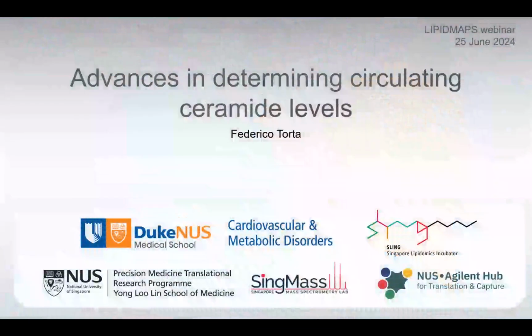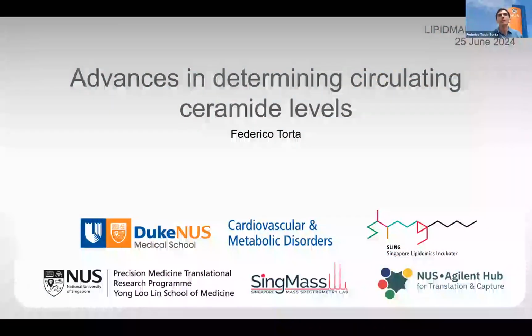Thank you, Maria, for the kind introduction. And thank you all for attending this webinar. I'm really glad and grateful to have the opportunity to contribute to this series of webinars. And today, I will talk about ceramides and their measurement in human plasma by mass spectrometry, of course.